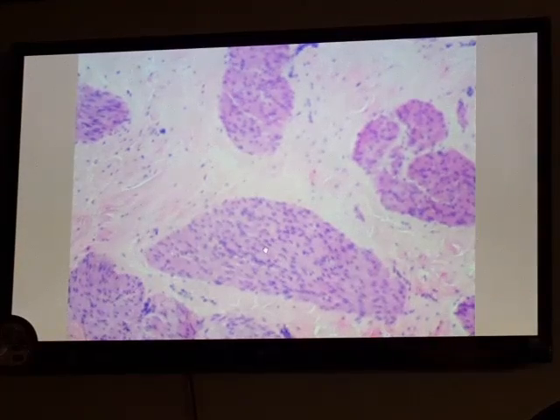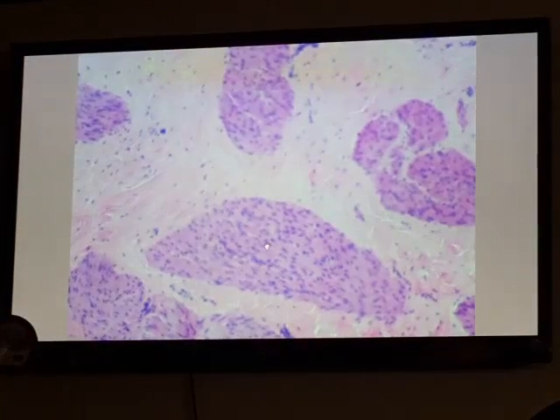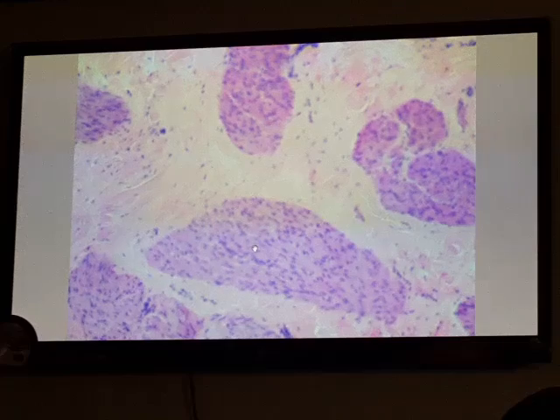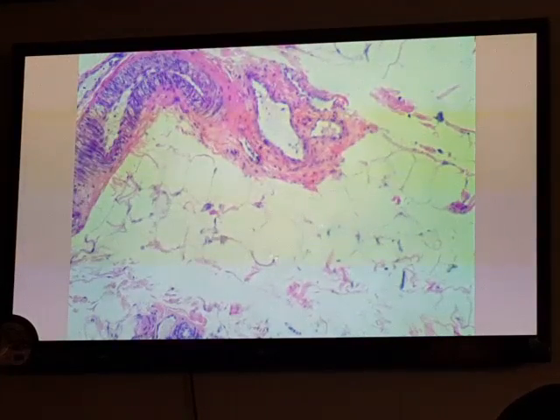Smooth muscle fibers are arranged in different directions. In this section, these bundles of smooth muscle fibers are called the detrusor muscle. We cannot distinguish them; there should be 3 layers but in different directions. So in the exam, if we point to this, it is the detrusor muscle. The last layer is the adventitia with adipose cells and blood vessels. This slide is stained with H&E stain.